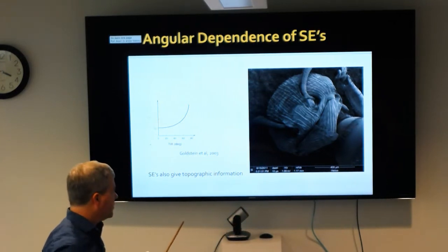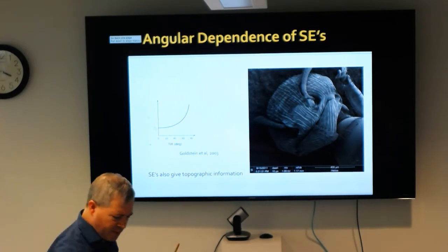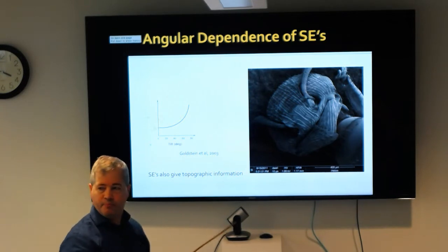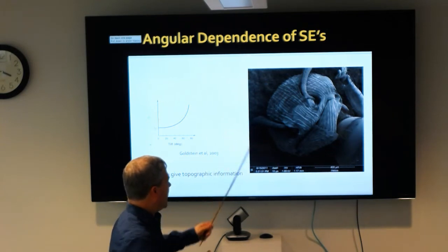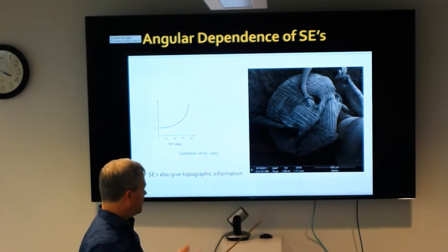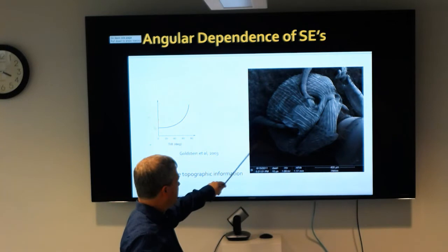Most of the pictures that you see of SEMs, when people look at bugs and things like that, they're looking at secondary electrons. You're not getting very high resolution as we think of high resolution, but it is very much magnified, and you get these very fine details.